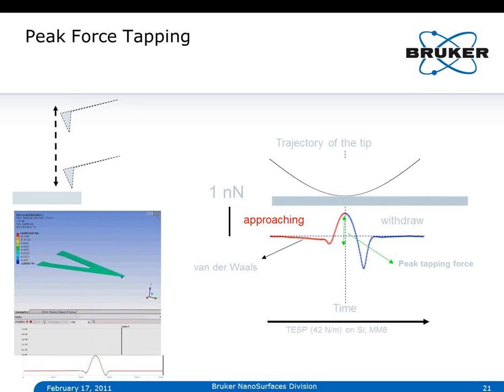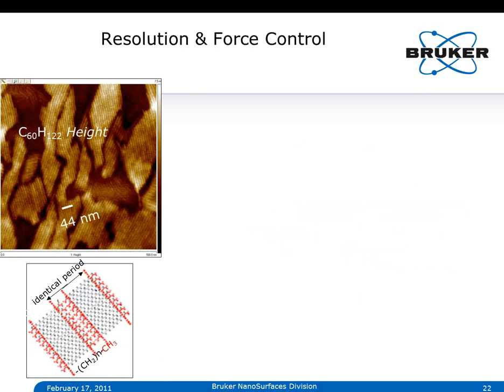And again, because we use the Z piezo to pull the tip free of the adhesion layer, we can use a very, very soft cantilever and gain a significant amount of force resolution here, so be much gentler to our sample than we could ever be in tapping mode, because we don't have to deal again with the adhesion layer. I mean, we still deal with it, but we use the Z piezo to deal with it instead of having our cantilever having to deal with it.